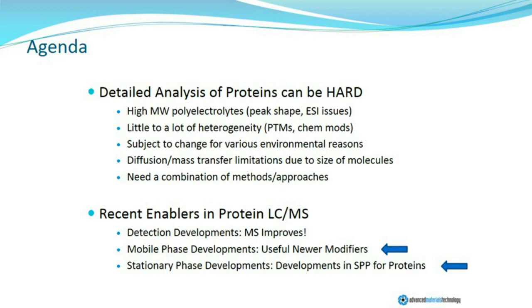I would argue that there have been a number of developments in mobile phase characteristics, not all of which will be discussed today, but certainly in terms of charge manipulation of electrosprayed analytes, as well as some of the things that I'll talk about today. This is making LC-MS analyses of larger molecules a more tractable challenge.